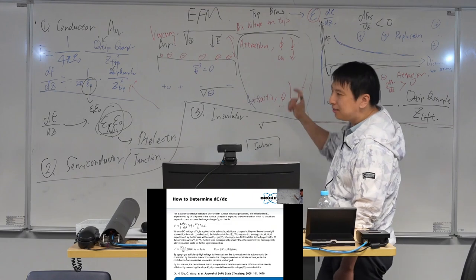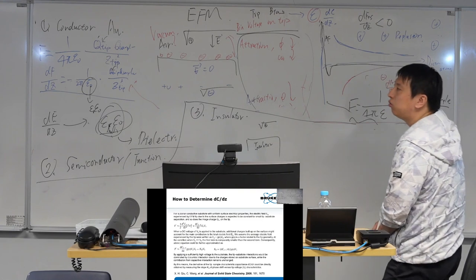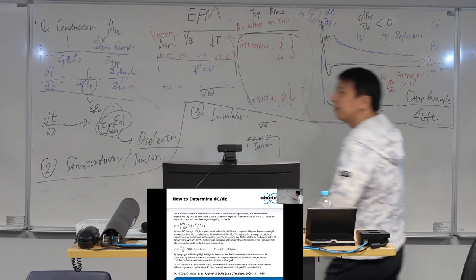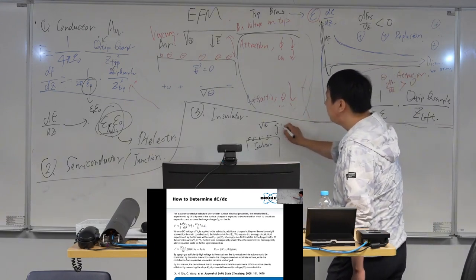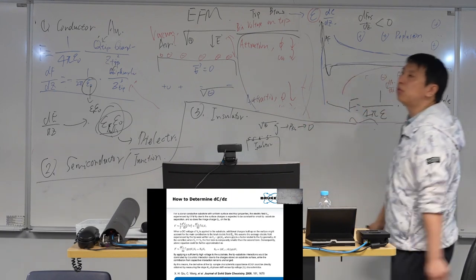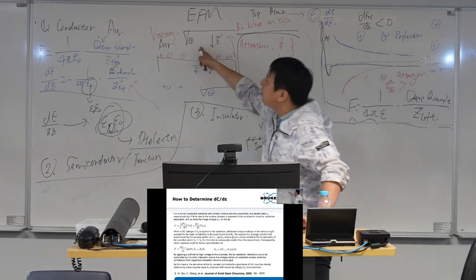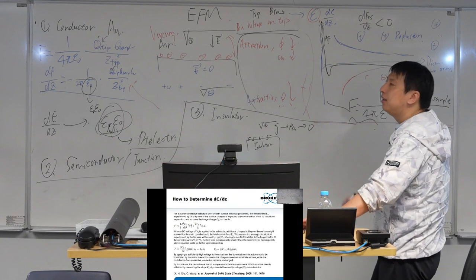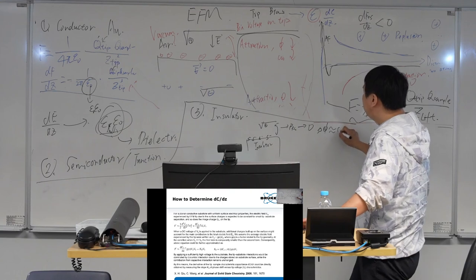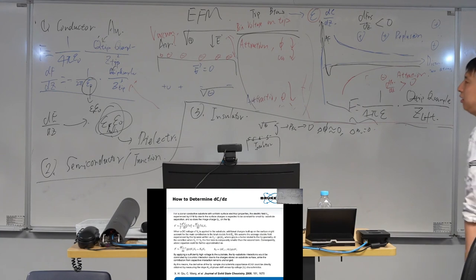So, for example, if we apply a positive voltage on the tip, it will be slightly negatively charged. So the interaction force between tip and sample is so small. So we would say on an insulator, using this way, we detect the losses. Delta phase will change by 0, delta omega will change by 0. Something like that. That's the insulator.